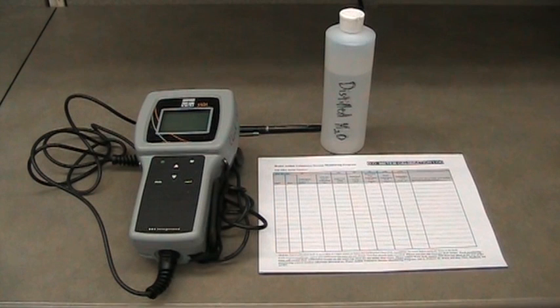Be sure to calibrate your dissolved oxygen or DO meter before you go into the field to collect data. Once you have calibrated your meter, do not turn it off until you are done with your monitoring activities for the day.